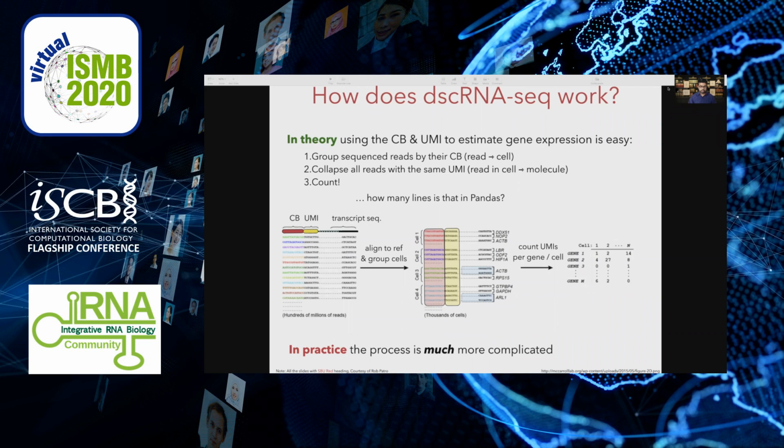In a typical droplet-based single-cell experiment, you are provided with paired FASTQ files. In the paired FASTQ files, one end represents the cellular barcode and the UMI. The second end represents transcript sequences. The problem of quantification involves grouping the set of reads, first based on the cellular barcodes, then based on the UMIs, to generate gene by cell count matrices.